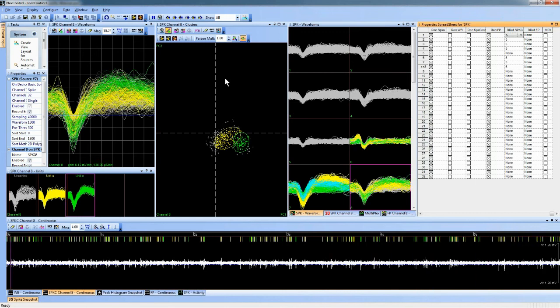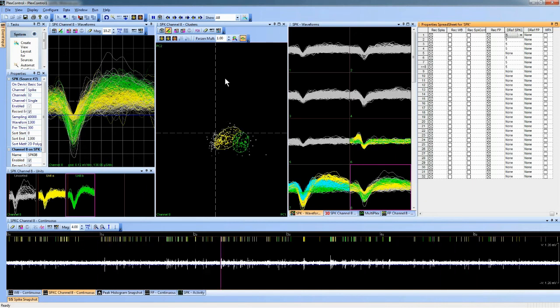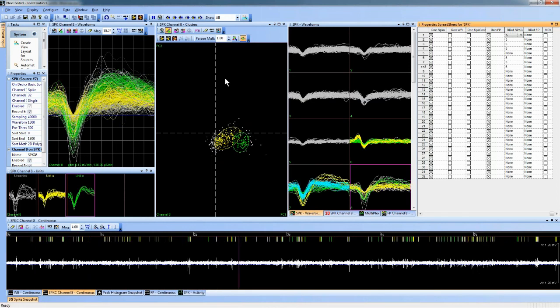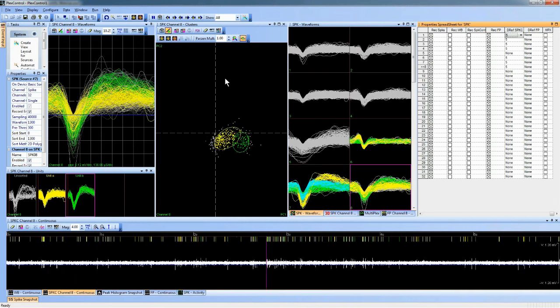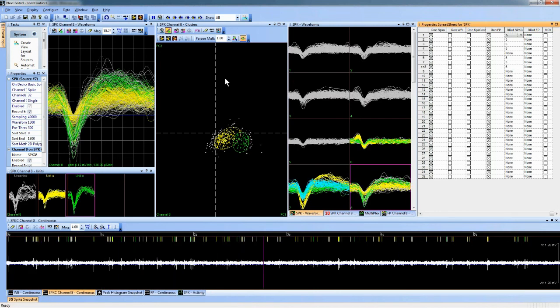It's a good question. I think there's a number of different things you could try. One is trying this aligned extraction online. He said that he's trying the alignment offline. Trying it online and seeing what kind of results it has online could be useful. And looking at aligned extraction and then potentially adjusting the threshold based upon the results that you get would be another way of trying to better differentiate more than one neuron on the same channel.